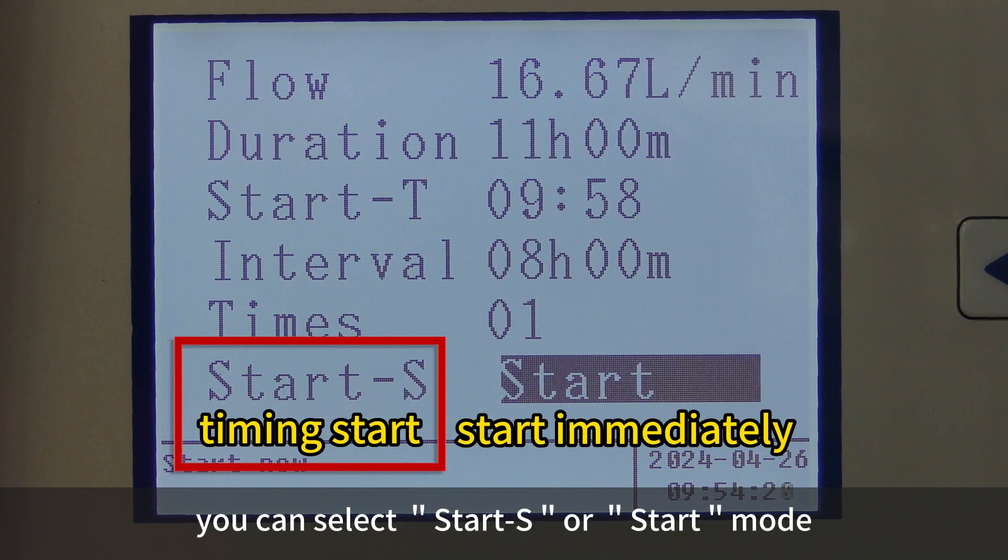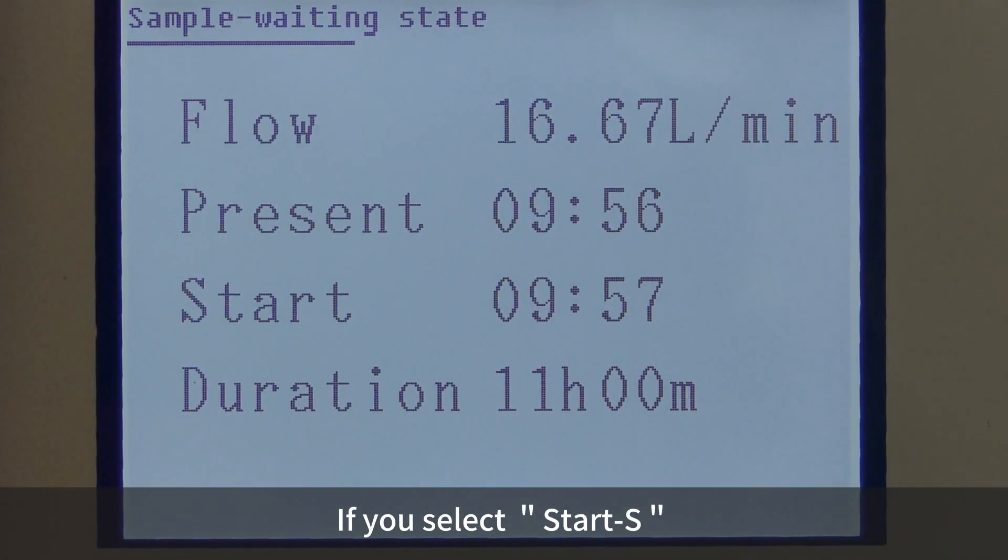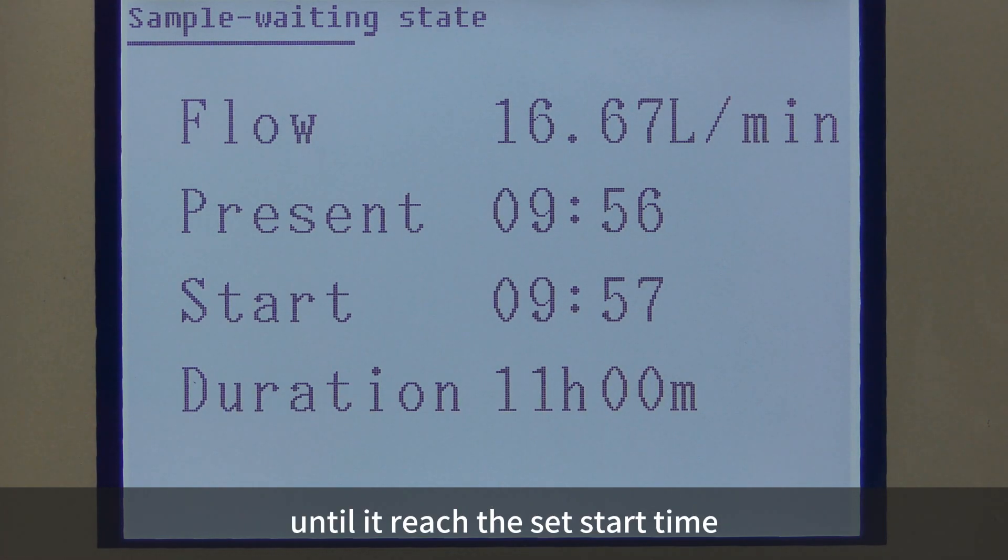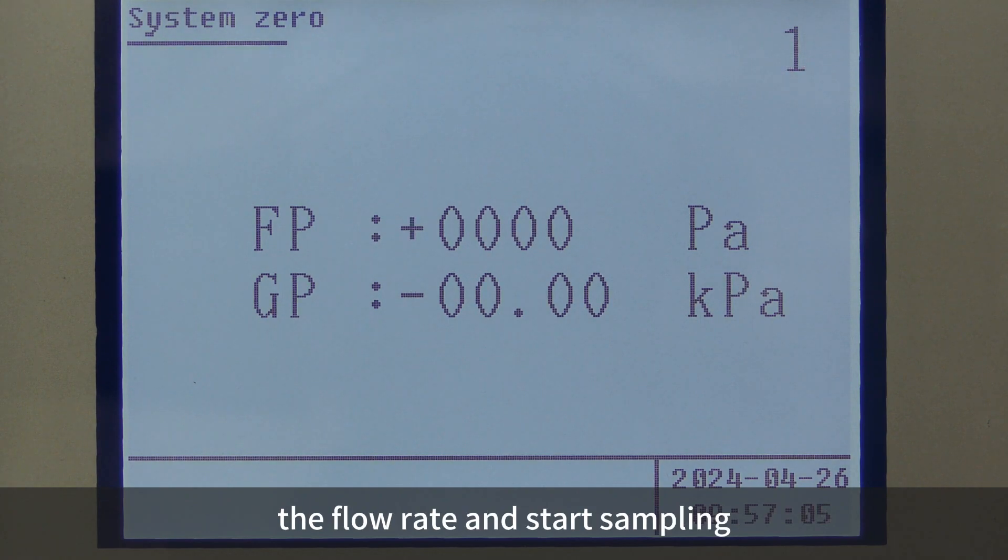If you select Start S, the sampler will start to count down until it reaches the set start time. The instrument will then automatically zero the flow rate and start sampling.